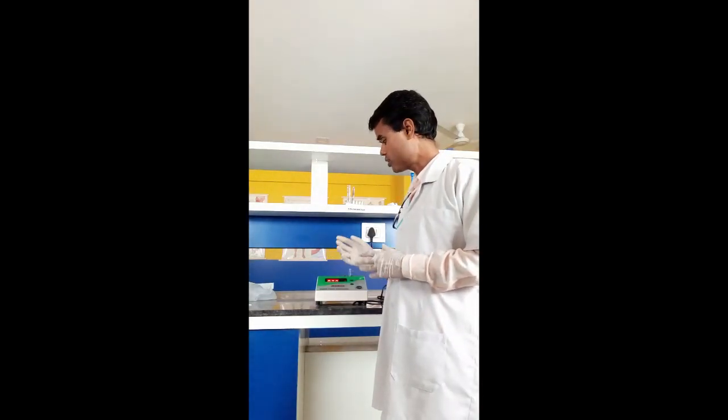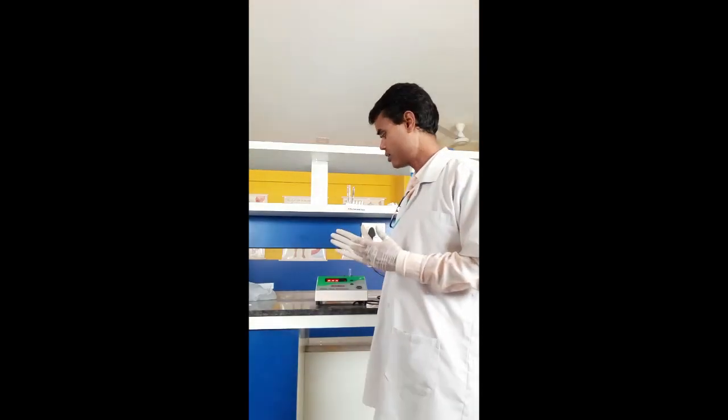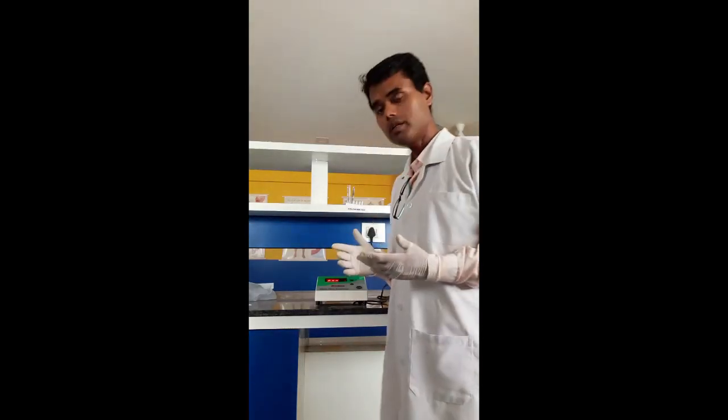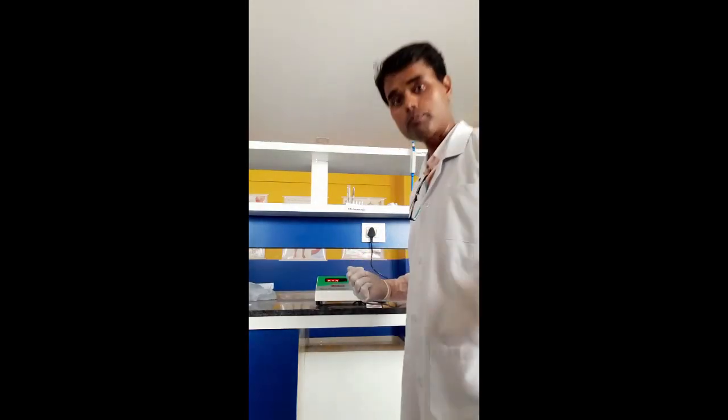So that measurement is taken by this instrument very accurately. Okay. So this is the function of the photometer, and this is the principle that I have explained. Now we will see a little bit closer its components and how to use it. First of all, we have to switch it on here.